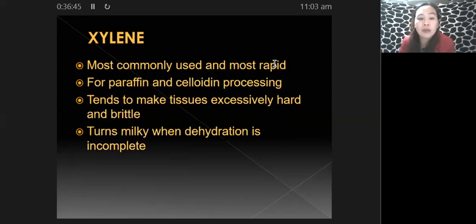when I mentioned in the previous video that the higher the concentration of your alcohol, the more it makes your tissues excessively hard. So that's the problem.